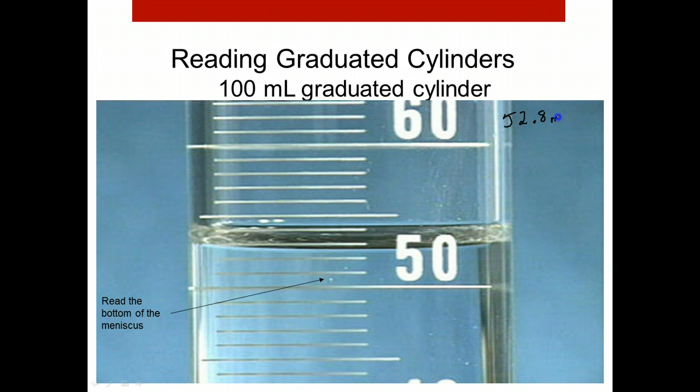And we have to put a unit, milliliters. All right, this digit right here was our estimated digit. So we're good. We put an estimated digit in here.